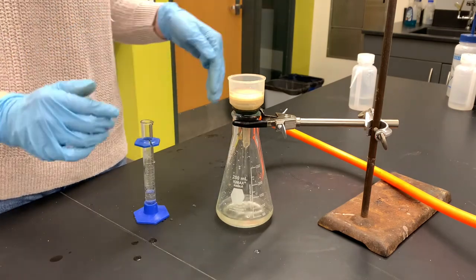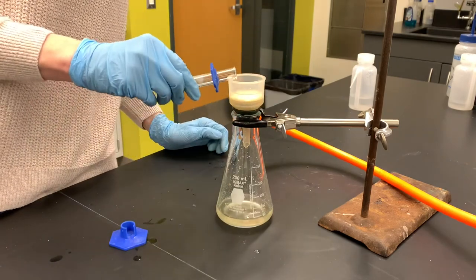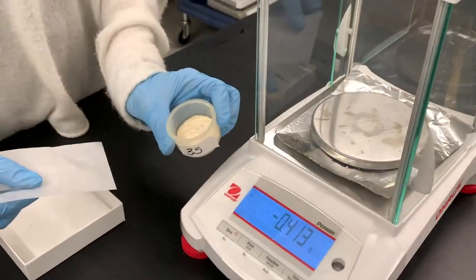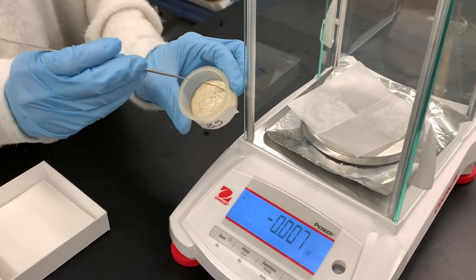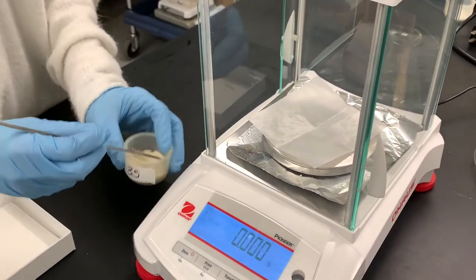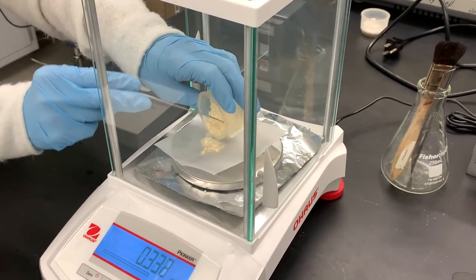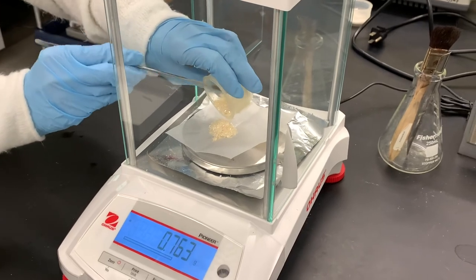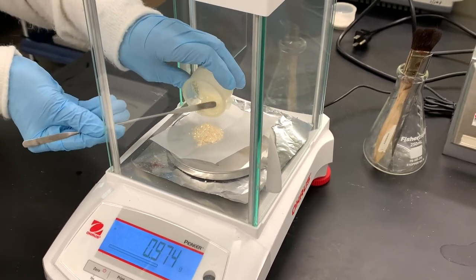Once these are done filtering, it's gonna sit in a desiccator at least overnight to let it finish drying. These crystals are really pretty, kind of a pale yellow flaky looking crystal. This is our bromo vanillin product. It's been drying for a few days in a desiccator. Next, I'm gonna take the mass. It's a really shiny, kind of a beige looking flaky, sparkly crystal, really pretty. Very dry, so hopefully that means that we're gonna find it's very pure.